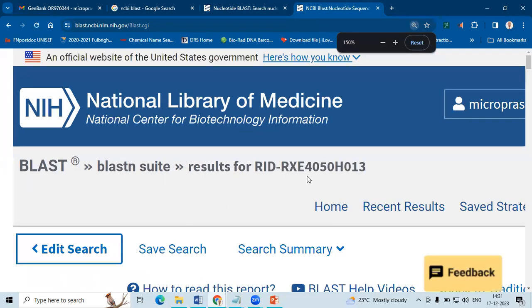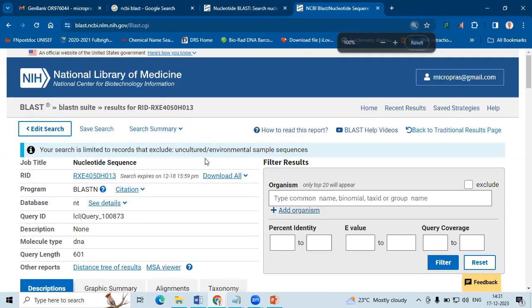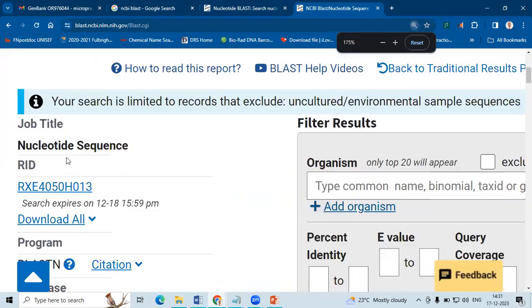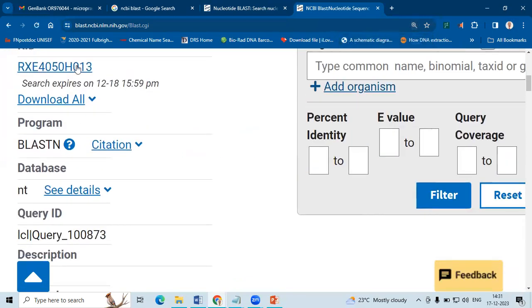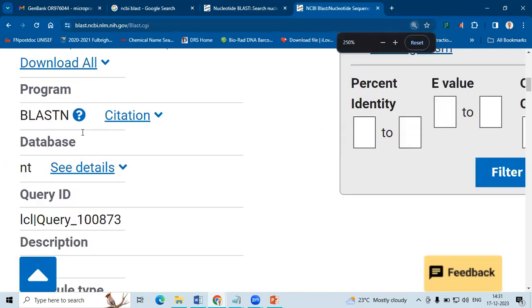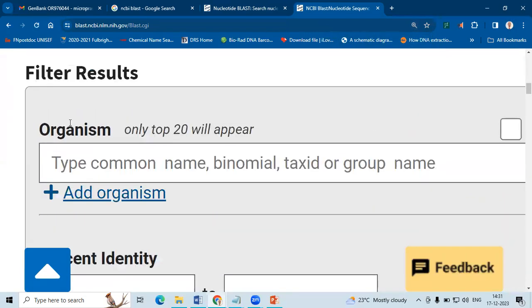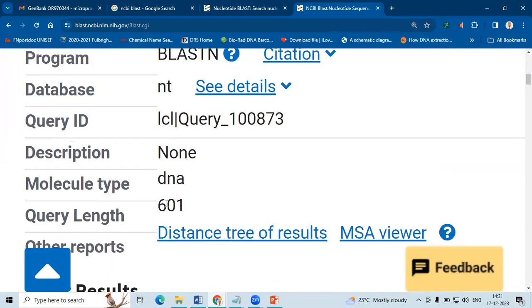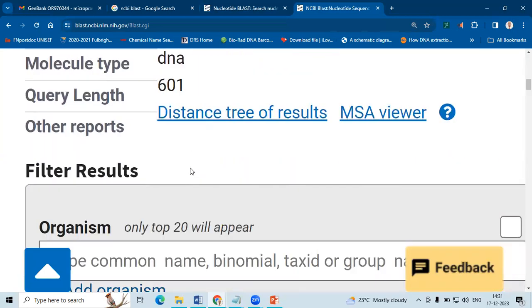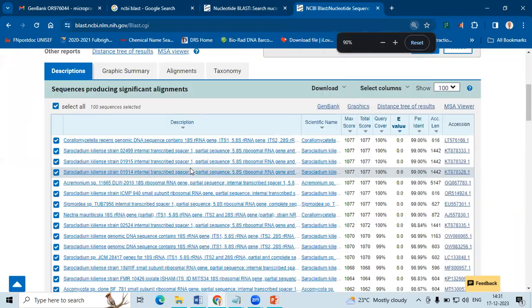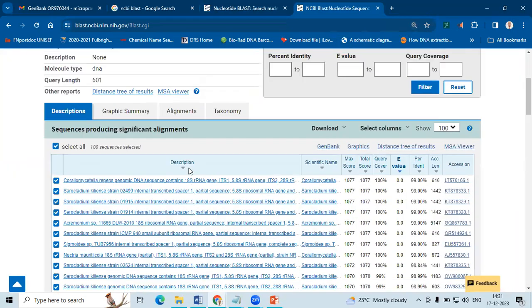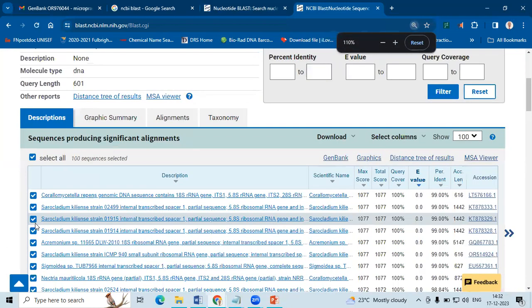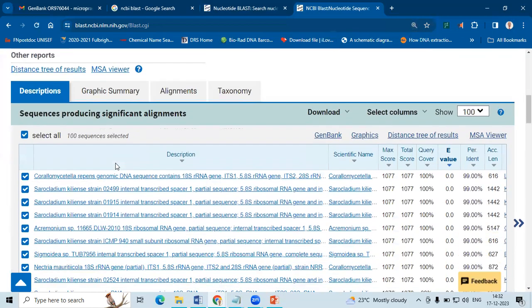So here is the result. The result has been displayed. If you can see in the topmost page, citation for BLAST if you are writing a manuscript. Our sequence is 601 base pair DNA type. So here is the result, the results are displayed.